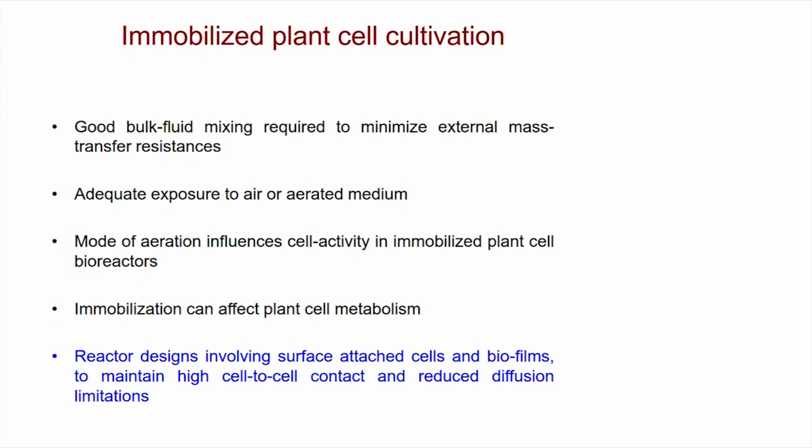Sometimes you will see that the culture reactor is separate from the medium. It is called a reservoir, and the biomass is kept in a separate reactor. If it is being worked as a packed column reactor, a packed bed reactor, then there is a reservoir, the media is circulated from the reservoir continuously and the spent media is again recirculated to the reservoir. So, why do you think this is being done not in one reactor? How will that help?